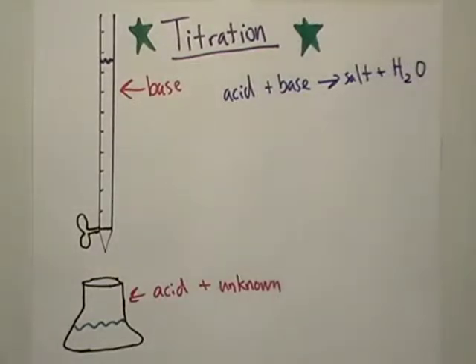Okay, so what is a titration? First of all, basically it's a way we're going to figure out some information about something. The best way is just to do an example.